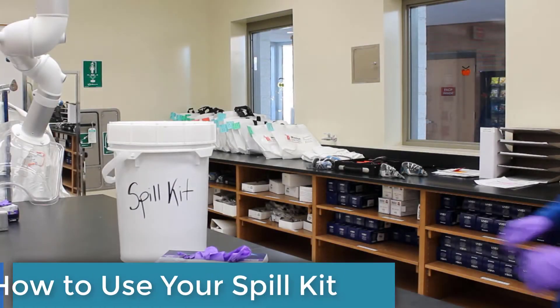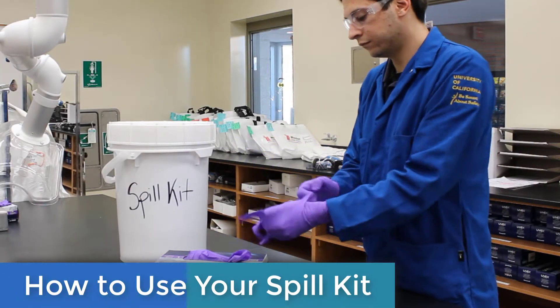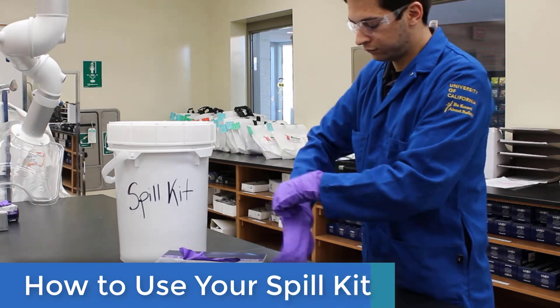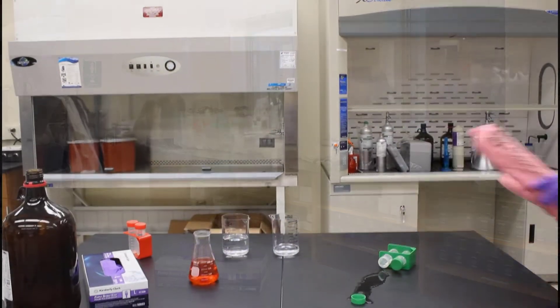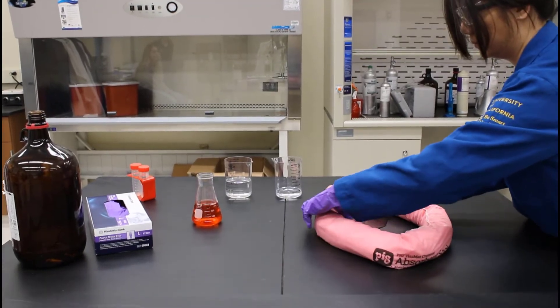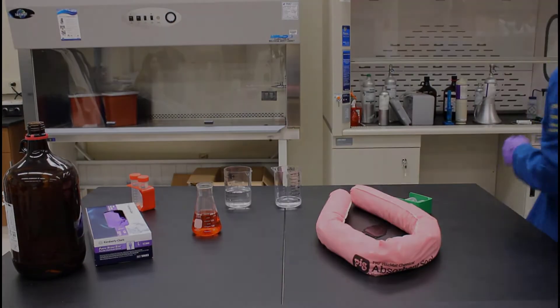If you're comfortable cleaning up the spilled material, here's how to use your spill kit. Start by putting on a second pair of gloves. Contain the spill to prevent spreading. Use the spill socks in your kit to create a barrier around the spill.